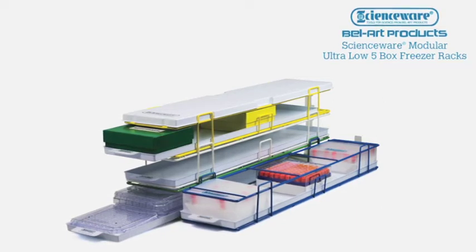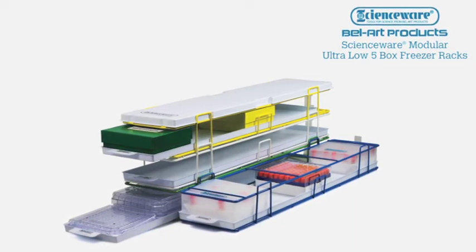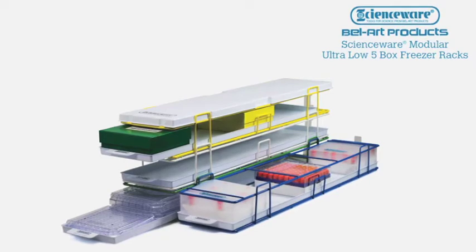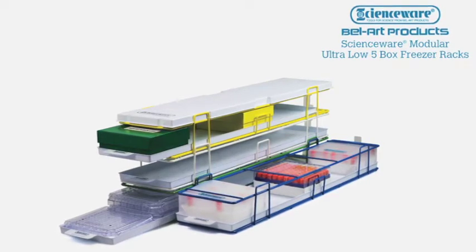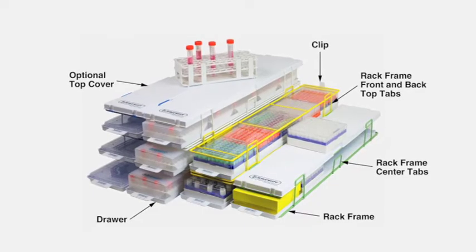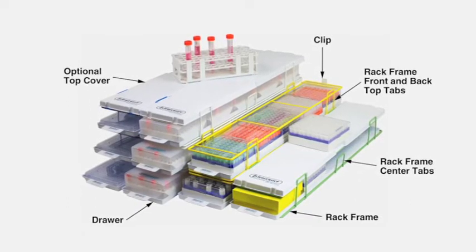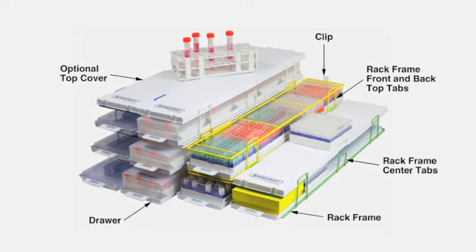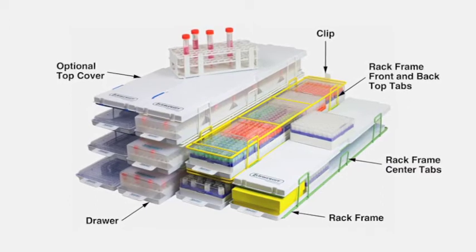Scienceware modular ultra-low five box freezer racks allow you to customize your freezer storage space. It is easiest to assemble these modular racks directly in the freezer, but before you begin you will want to identify each of the parts we will be referring to.